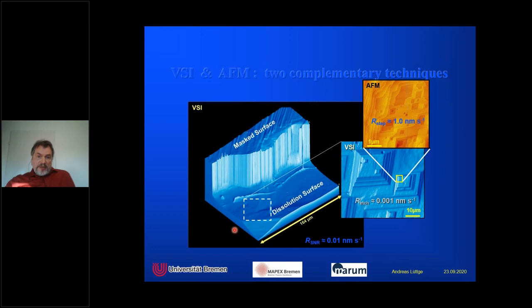The great advantage of white light interferometry for me is that it can measure very large height differences, in this case 1,000 nanometers, 1 micrometer, but you can go to several dozen micrometers in height with a very high resolution. On the same data set, you have all this information. We can typically be at a 1 nanometer resolution or even down to the angstrom resolution. If we need more, we can focus on this little corner here, for example, and utilize atomic force microscopy to have an even closer look at our problems. So we can quantify surface area very precisely. The resolution up here is also in the 1 nanometer range.